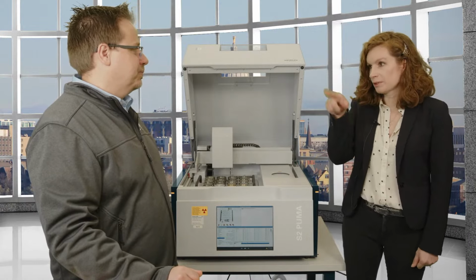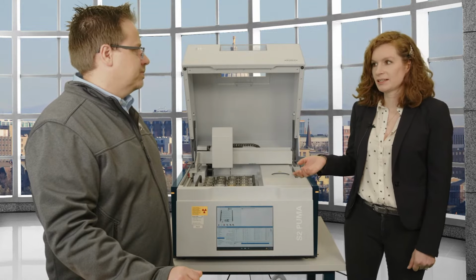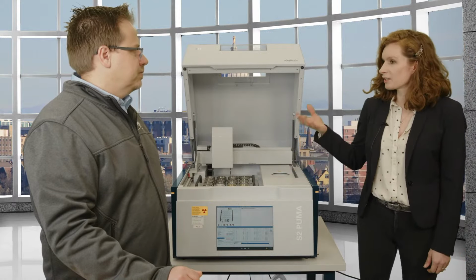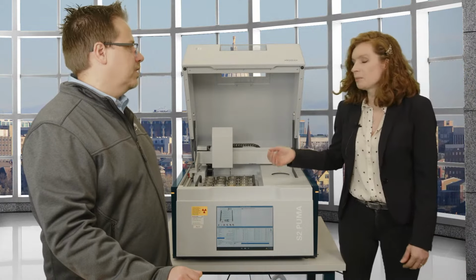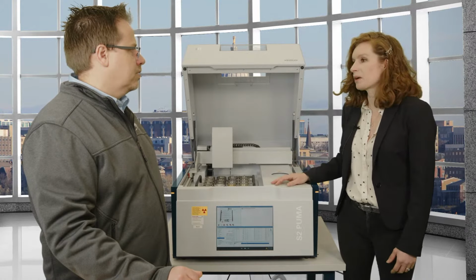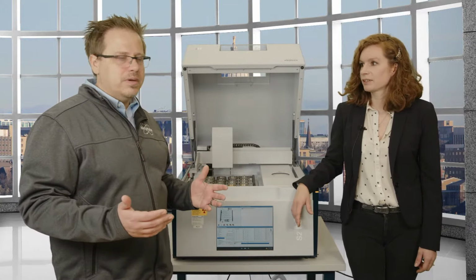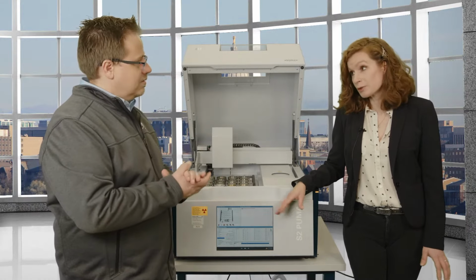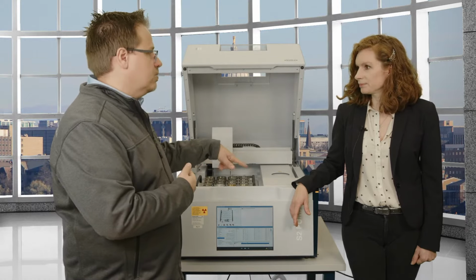If you remember what we looked at for the modes earlier, there was vacuum, helium, air. If I measure in air mode, I can't see light elements, and if I'm far enough away, I won't be able to see anything. One of the things you have to learn if you work with radiation is to go far away from the source. But this one, because it's shielded, even if it were open, it's not high enough power. Those machines at the doctor's office use 300 kilovolts or so, which is much higher radiation and a different situation, with shorter amounts of time. That is true. These things are super safe, not only on the radiation but the mechanical side too.